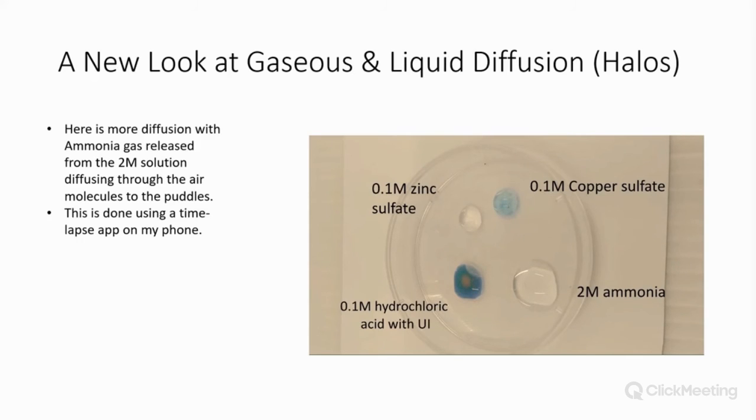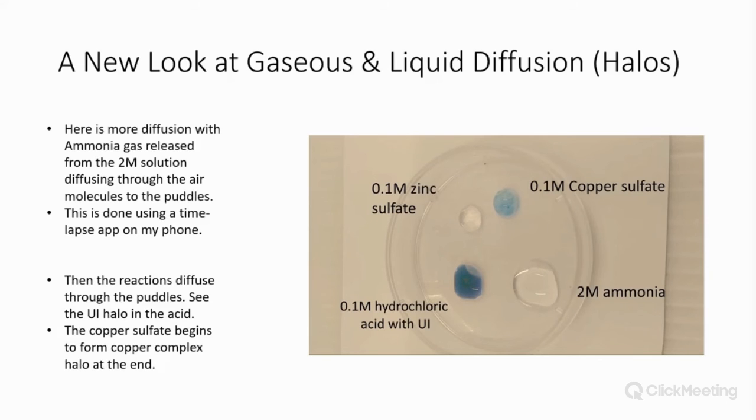Very interesting. I can do this with quite toxic gases, with the nitrogen oxides and sulfur dioxide as well. And with sulfur dioxide, you can put it through into barium chloride solution with peroxide, hydrogen peroxide, and some without. And with the hydrogen peroxide, you get the white precipitates. And you can connect that with the formation of acid rain.